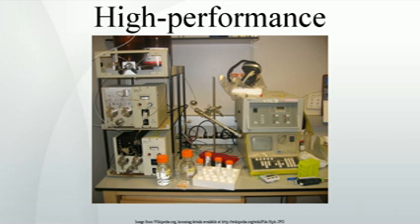The two components of the mobile phase are typically termed A and B. A is the weak solvent which allows the solute to elute only slowly, while B is the strong solvent which rapidly elutes the solutes from the column. In reversed phase chromatography, solvent A is often water or an aqueous buffer, while B is an organic solvent miscible with water, such as acetonitrile, methanol, THF, or isopropanol.